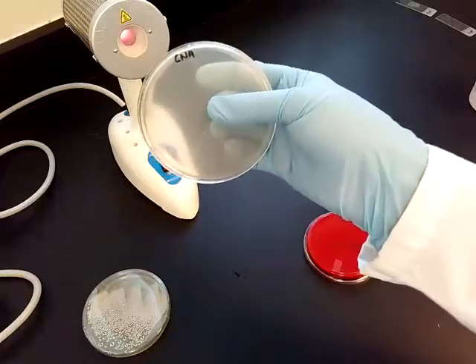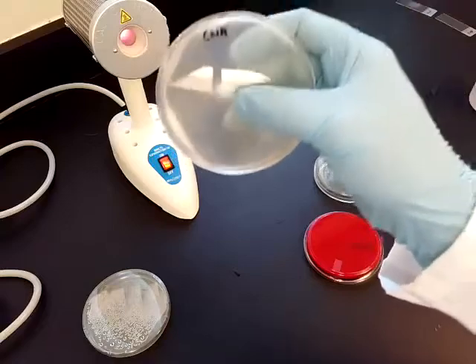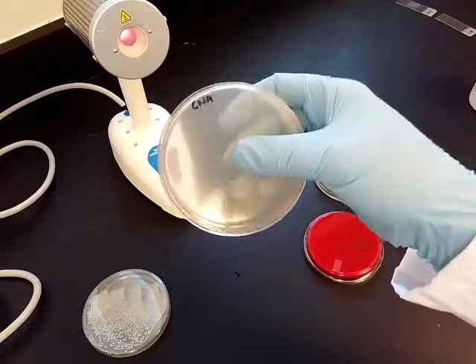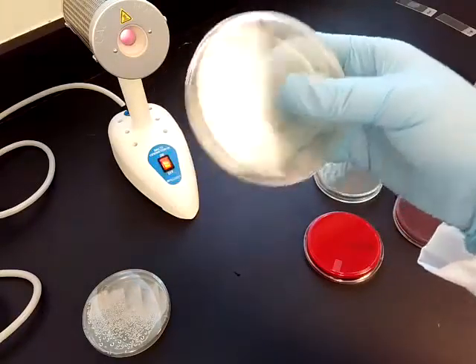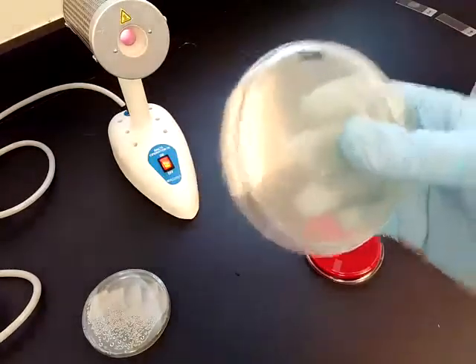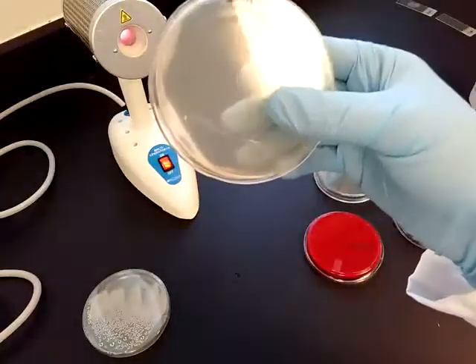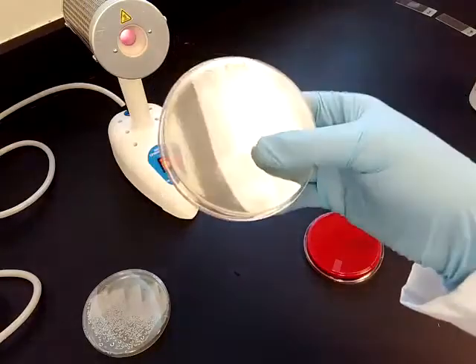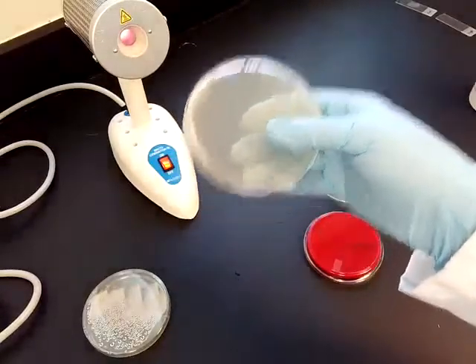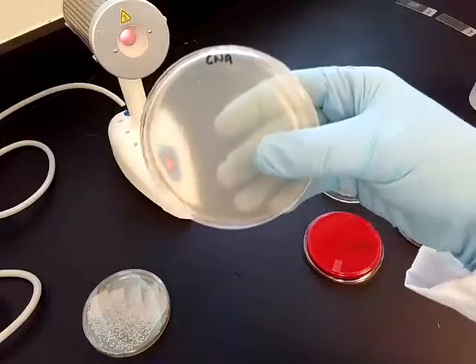This medium is colistin nalidixic acid, CNA agar, and this one selects for gram-positives and selects against gram-negatives. This one is commonly used for skin infections and wound infections. The reason why we use this is because on the surface of the skin, there's some gram-negatives that we don't care about. We want to grow the gram-positives because typically skin infections are going to be caused by those gram-positive microorganisms. So it's selective because it selects against gram-negatives, so it kills off the gram-negatives, and it selects for gram-positives, so it only allows those gram-positives to grow.